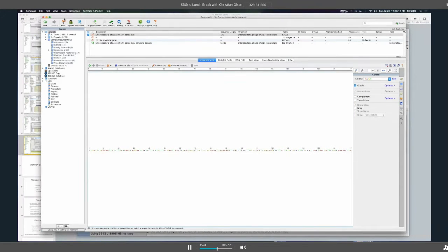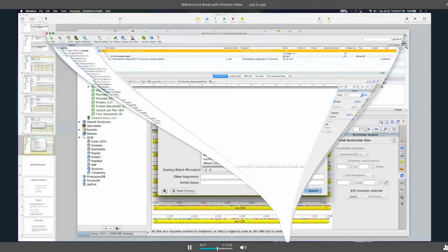Perfect. In terms of limitations for custom BLAST database, I have pushed this around quite a bit on my local machine. So I'm running a MacBook Pro, 16 GBs of RAM. It's an i7 chip. So I can build a BLAST database of 5 million sequences quite easily, depending upon your sequence length and your hardware resources that will dictate how fast the search happens. Okay, so you may want to make a number of different BLAST databases.